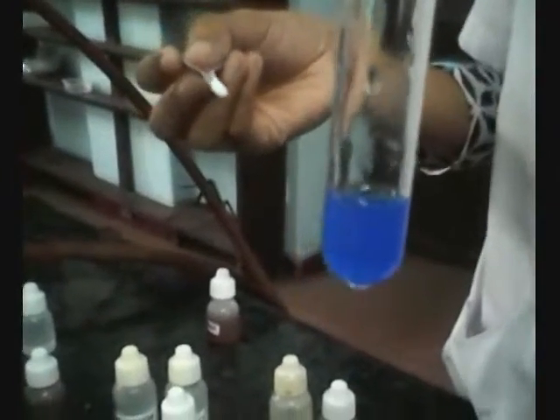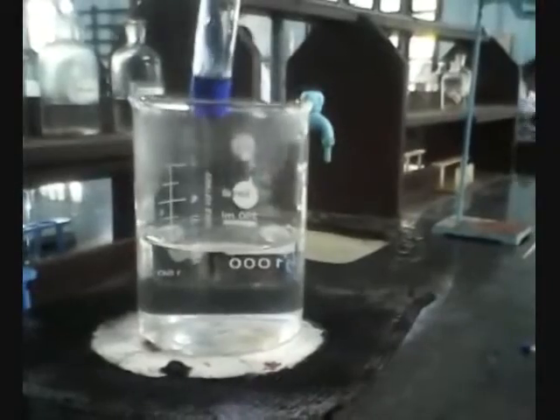To about 2 ml of Benedict's solution, add a little of the compound and heat on a boiling water bath for a few minutes. A reddish brown precipitate. The compound is a reducing sugar. So, the given compound is an aliphatic saturated reducing sugar.